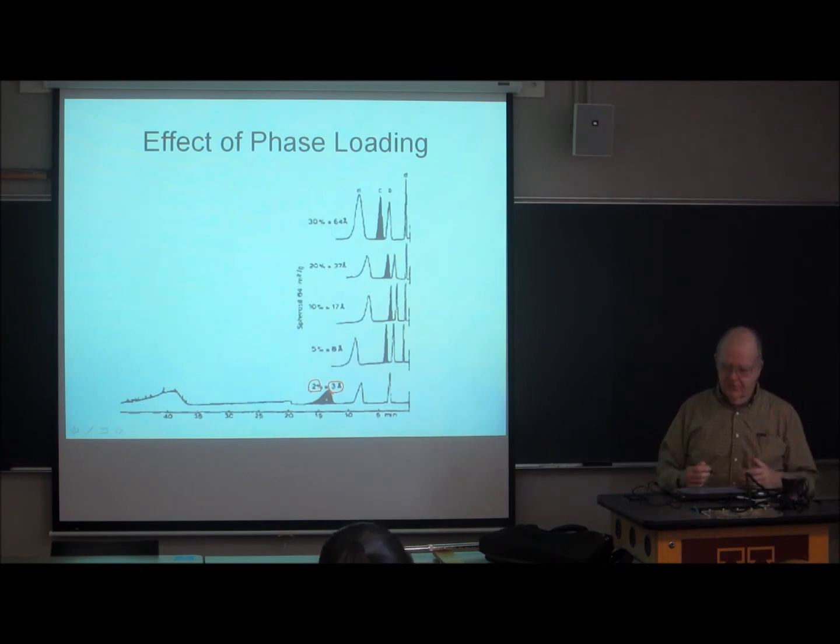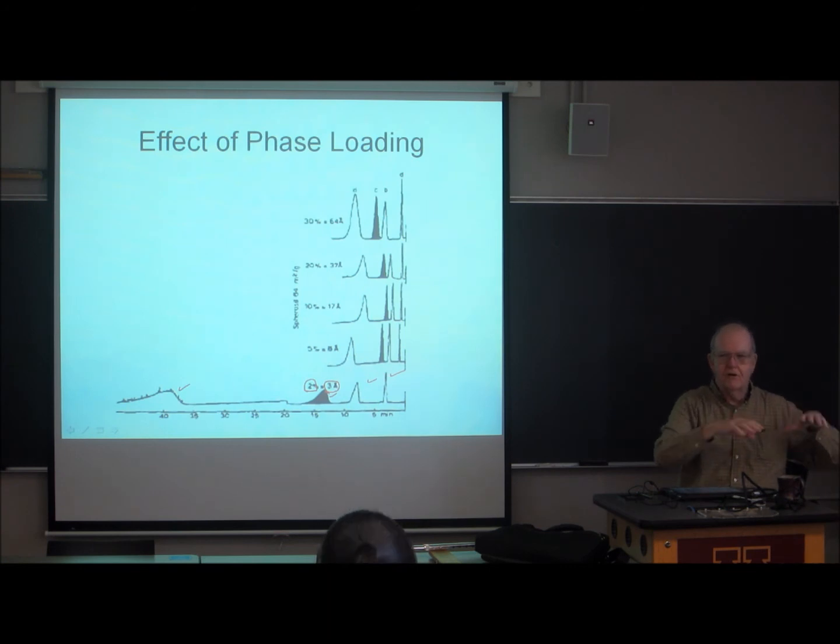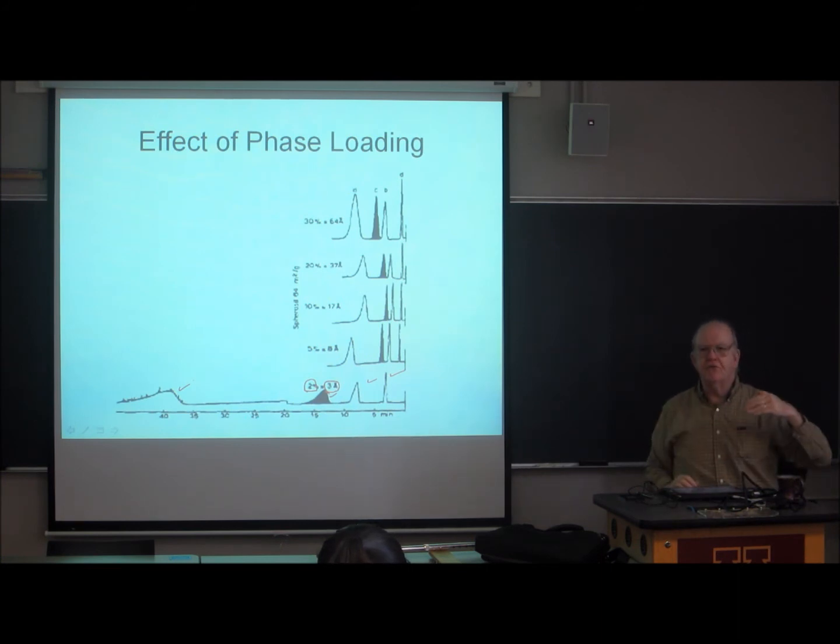And then they go and do a chromatogram, and I don't know what the mixture is here, but these are your chromatographic peaks. And they look pretty terrible. The surface is not uniformly coated. There are bare spots on the surface with no coating. And the sample is interacting with those bare spots and is desorbing from them slowly.